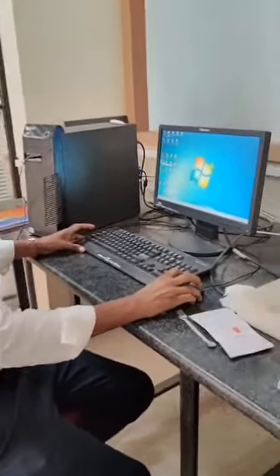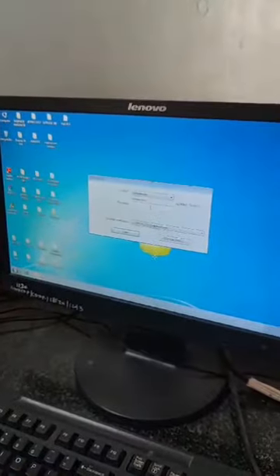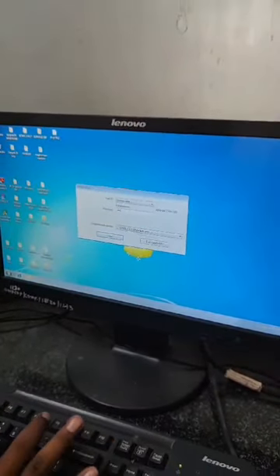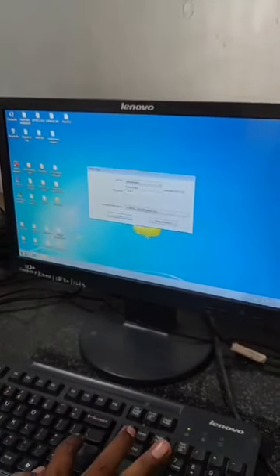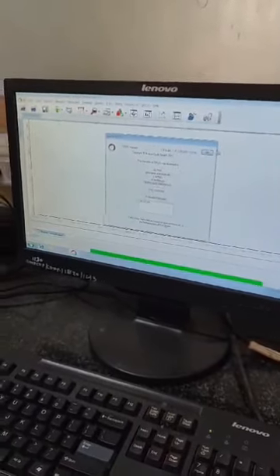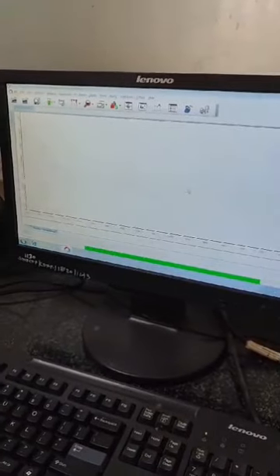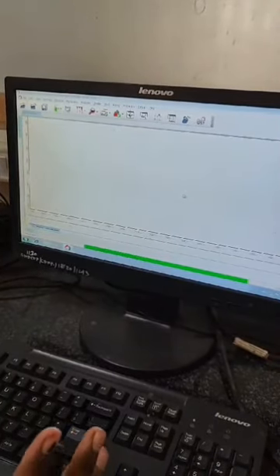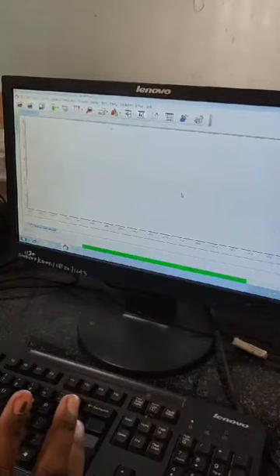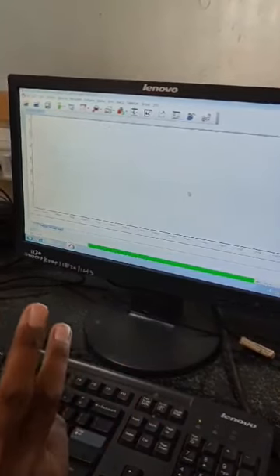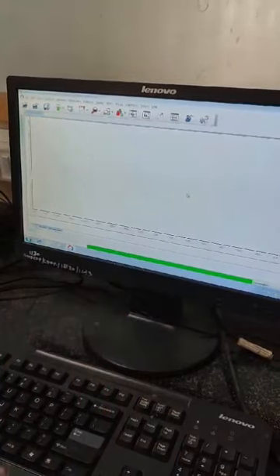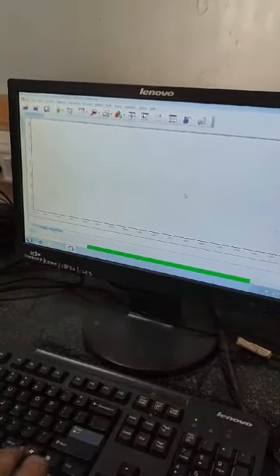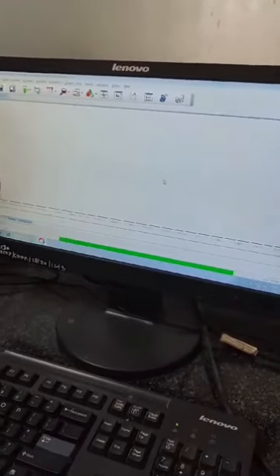Now I will double-click on the software. It asks for a password, so I will enter the password. This is the OPUS software. When we start the IR, the software automatically starts the calibration or validation of the instrument.